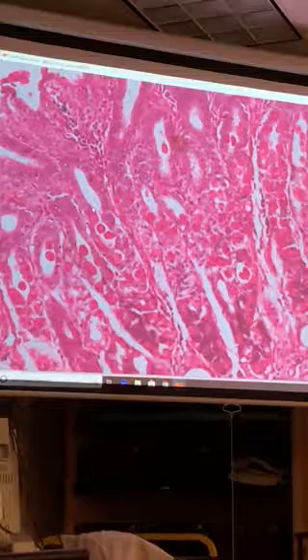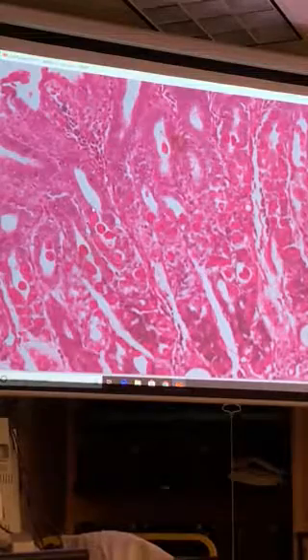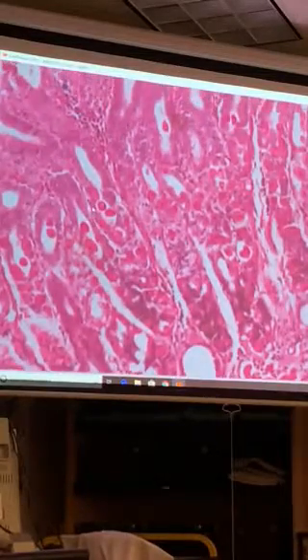Anything else on this one you wanted to? The only other thing we did was the mucosa. I believe just named the main layer, mucosa. What was 11? Gastric gland. Oh, we haven't done 12. Did we do 12? No.